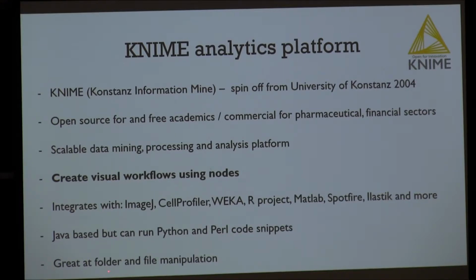One of the advantages of this program as opposed to Cell Profiler is that it's not just the image processing that you can use it for. It's also good for things like folder manipulation, changing file names, pulling out metadata from XML files, creating XML files, all of these little bits that you would not traditionally get within just an image analysis workflow.